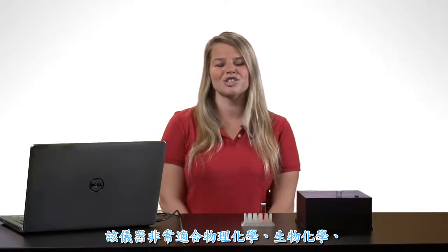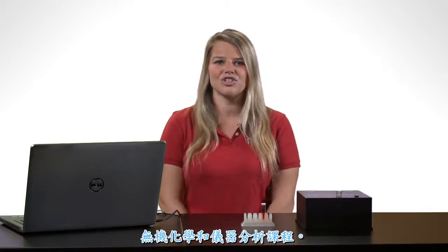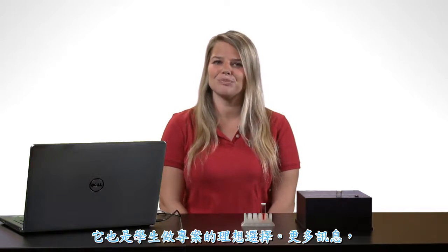This instrument is great for physical chemistry, biochemistry, inorganic chemistry, and instrumental analysis courses. It is also ideal for student projects.